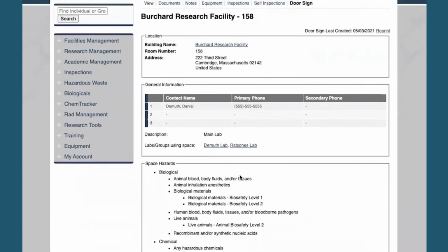Oh, it's great to be able to see that all of this information that's already present in Bioraft is just being used and repurposed for this particular application. I mean, being able to draw on all of that and not need to do any real additional manual labor and data input to try and put together this important piece of communication is just really a huge time saver and helps with that kind of standardization that you mentioned earlier.